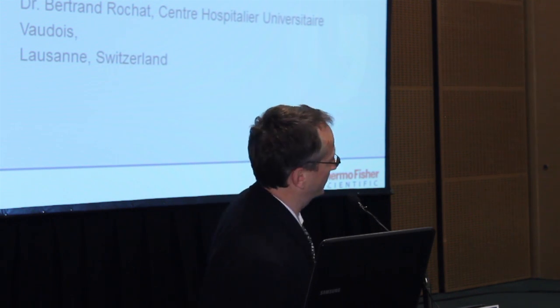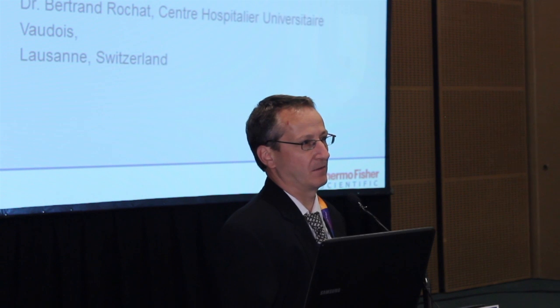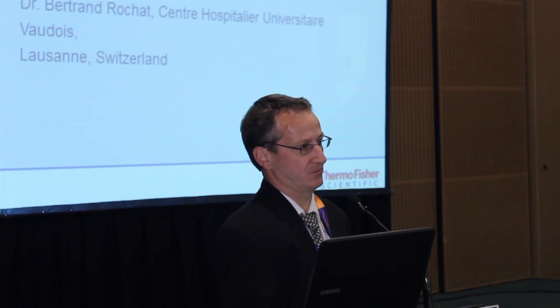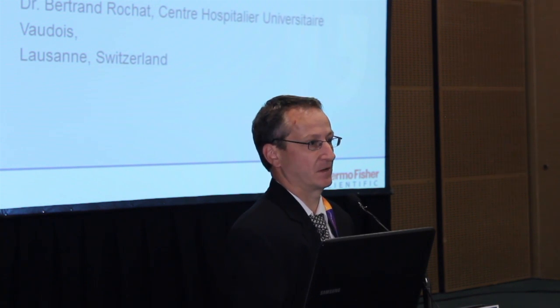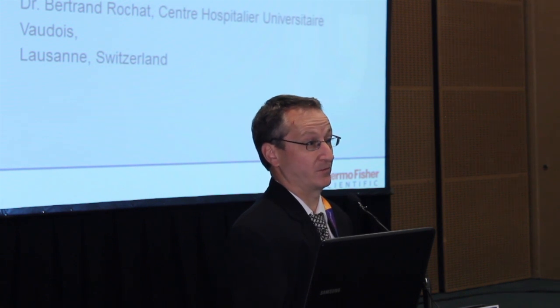I think this is a trend, as I said this morning, a trend where MS makers will push for high resolution, especially if, as customers, we are asking for it. That's also a point. The vendors are looking for what we need, but if we don't move, they will not move.